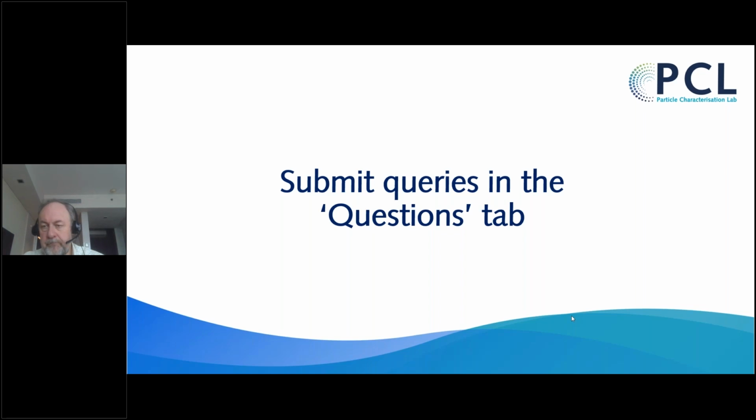Daryl, we have a question coming through, and it might be a long one, so I'll just read it aloud. What are the possible causes, the different causes, for powder caking? Well, can I make a suggestion? I'm going to talk about powder caking a bit later on when we talk about powder flow. But in short, you're looking at either deliquescence events on the surface of particles, or plasticization, which softens amorphous particles. They're probably the two single biggest factors.